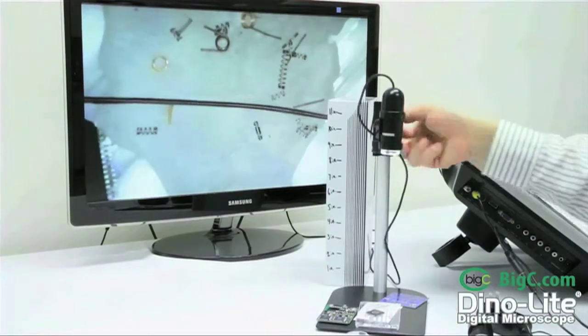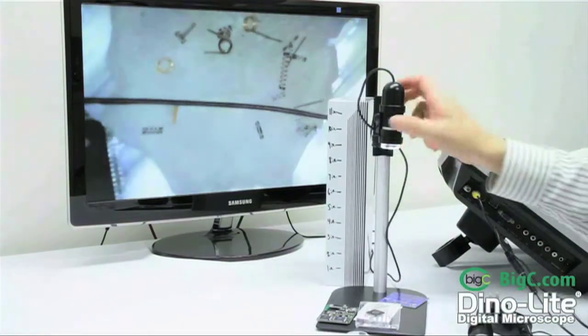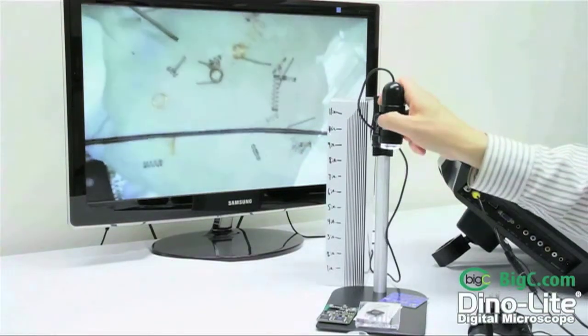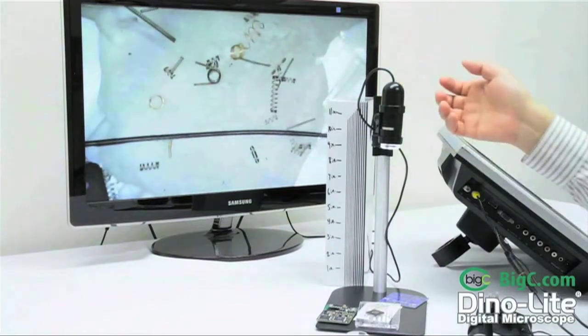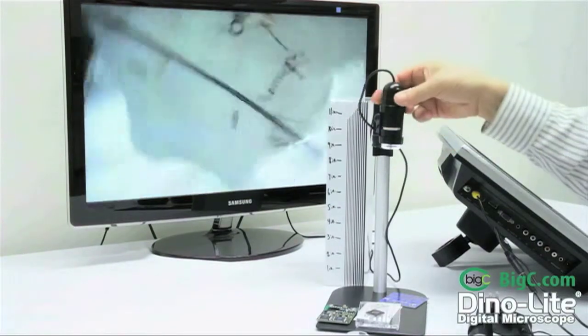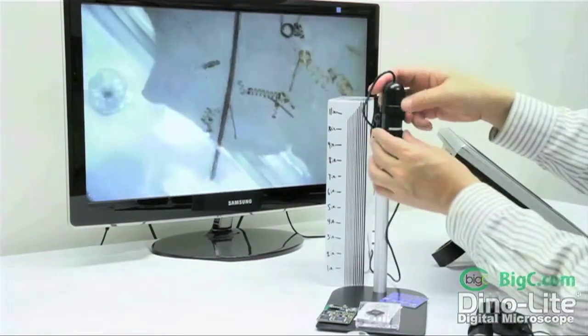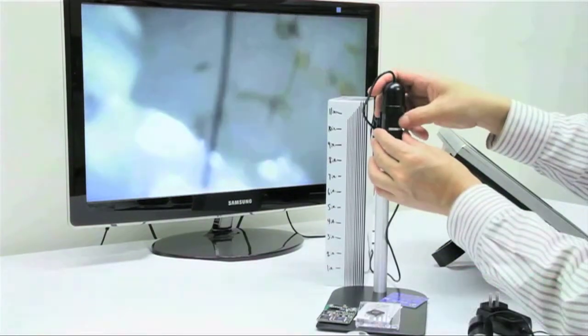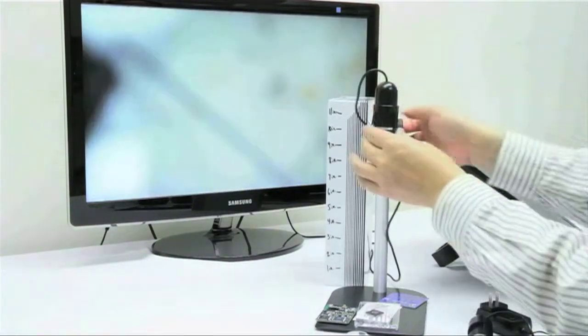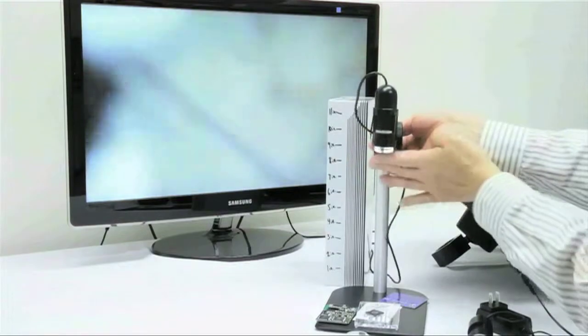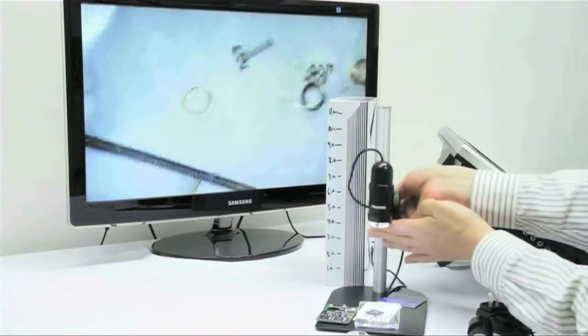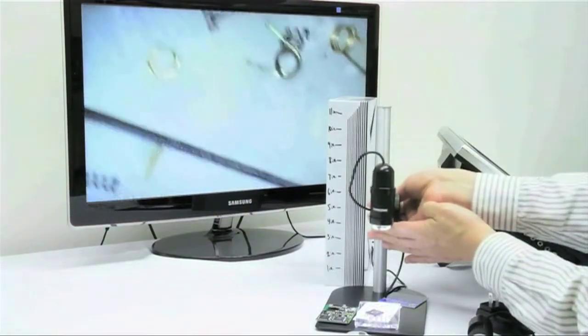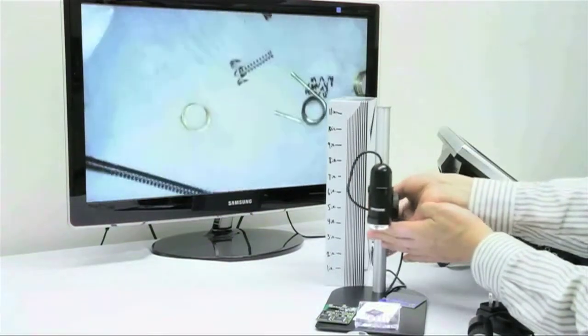As you turn the outside dial, the lens will travel up and down within the housing, allowing you to change magnifications as well as focus in. Now we will set the magnification to 30 times and move down until we get into focus.